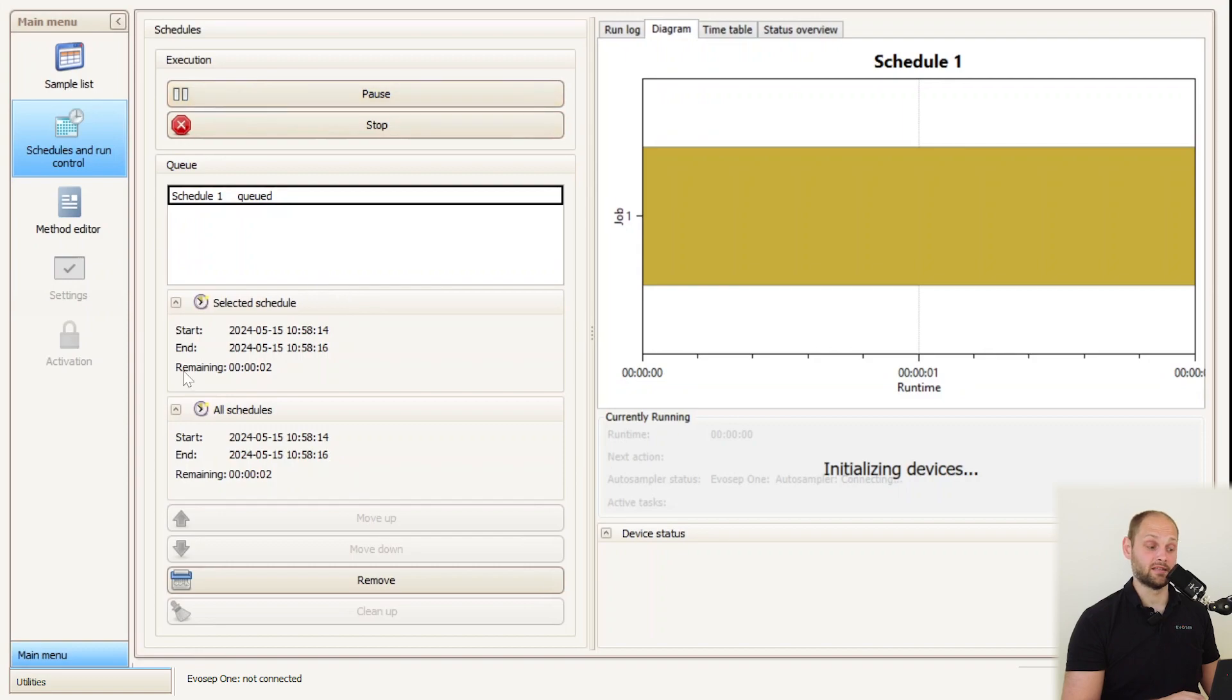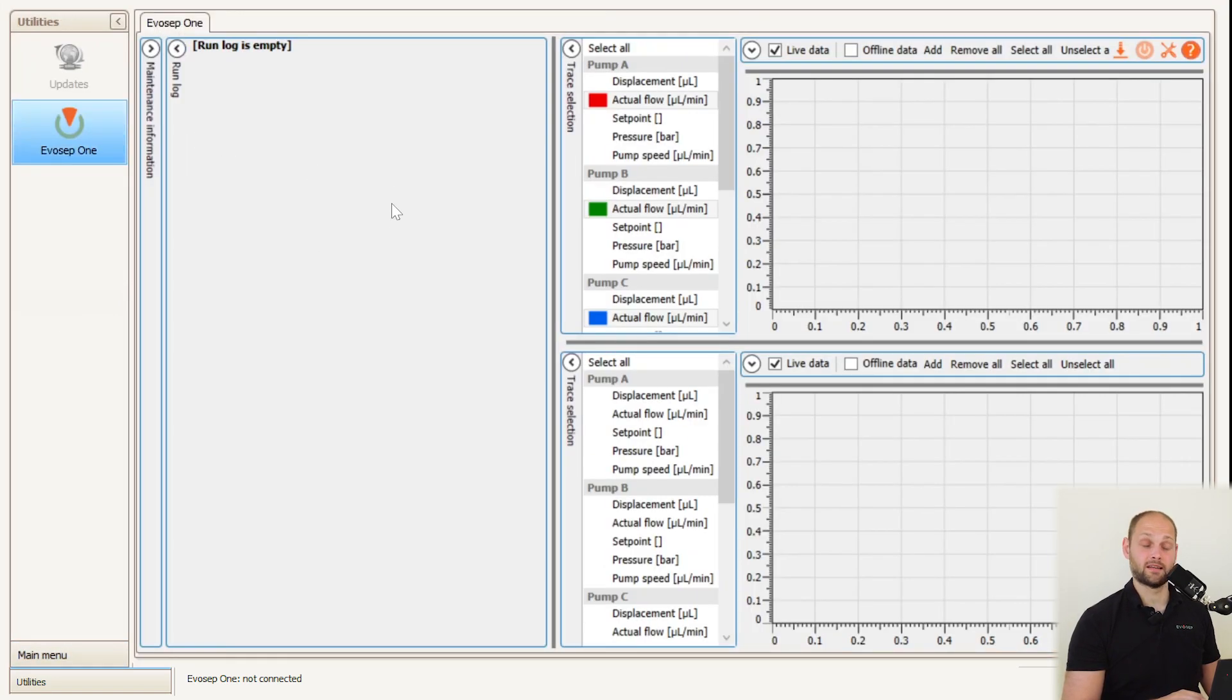After starting it, you'll need to navigate to the graph viewer which will present information regarding the system's current configuration.